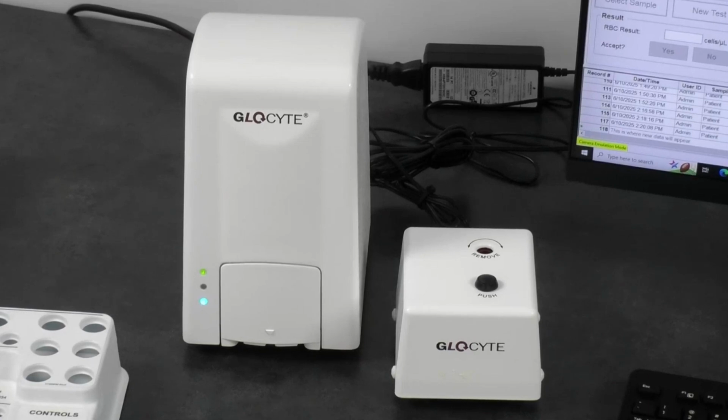All right, and I know we're running up against time. What is the required maintenance? Great question, Michelle. That cool vacuum that Jordan has on our screen right now has an O-ring that we recommend changing every 6 months. Other than that, we recommend an annual PM of the GloCyte, but the system is very, very robust. So besides an annual PM and changing out that O-ring, that's really all that we require as far as maintenance. Nick just dropped that into the chat for everyone: the detection capability, the reportable range, as well as the AMR. Let us know if you have any questions.